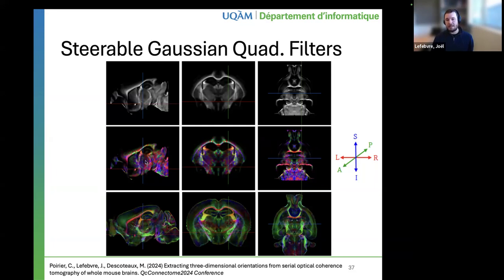For example, this analysis was done at a much lower resolution of 50 micron. This is really low for our kind of data. And we could adapt our technique to perform that analysis at 3 micron. So that's the kind of work we are pursuing in my lab.